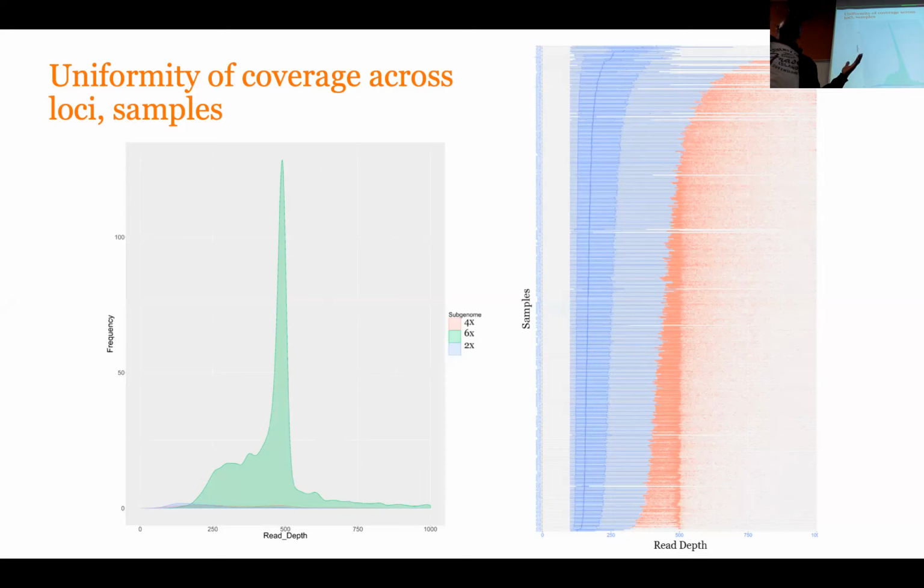So the first thing you want to look at once you get your VCF file is to extract some key information. What type of information do you think you would need? Well, it depends on what you want, but you definitely want to see what the genotype is. That would be the first thing. Sometimes you might need to retrieve the read depth because you might want to use that for filtering.